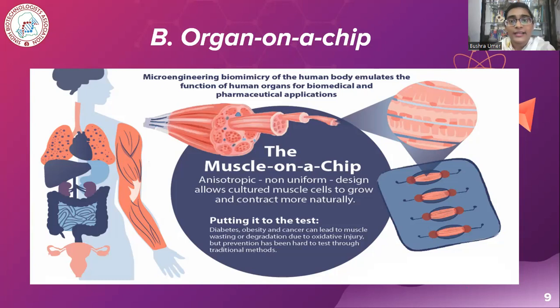So to identify how the muscle is deteriorating and how its function is destroyed, we use organ on a chip technology.